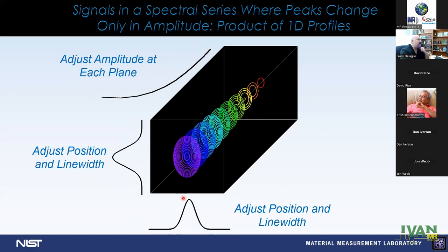And now we can fit this entire 3D volume of data in terms of three one-dimensional functions. And in the course of a spectral modeling application, a spectral fitting application, we can generate a 1D profile and adjust its position and line width in this direction, and a 1D profile and adjust its position and line width in this direction, and extract a set of amplitudes. And we don't need a particular model. We can just find whatever intensity value gives the best match to the spectrum. So we build a pseudo 3D signal as the product of three profiles, and we determine what those three profiles are during line shape fitting.